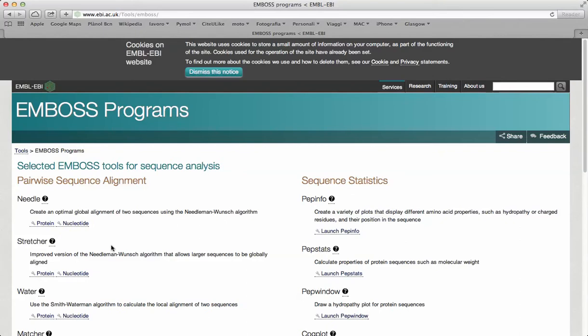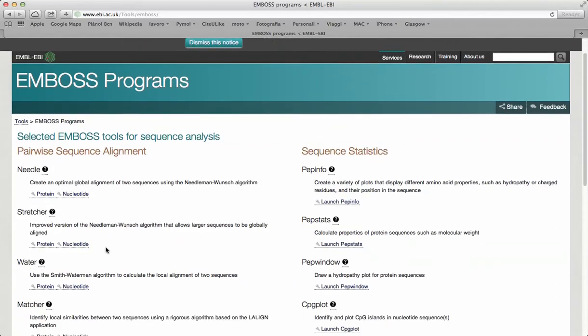On the pairwise sequence alignment page, there are a variety of options. You can choose between global and local alignment. Each of them contains several different algorithms.